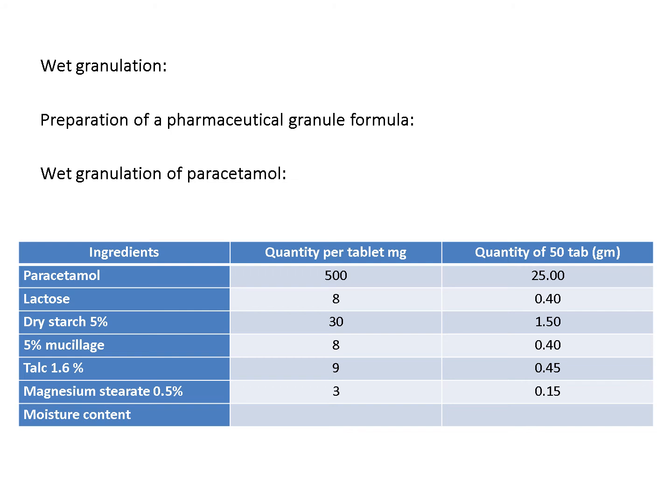A diluent could be added for different purposes, not for increasing the weight or bulkiness only, but it can also enhance compressibility. I need to add dry starch at 5% out of the 600 milligram. If we multiply 5% by 600, it will be 30 milligram per 1 tablet.